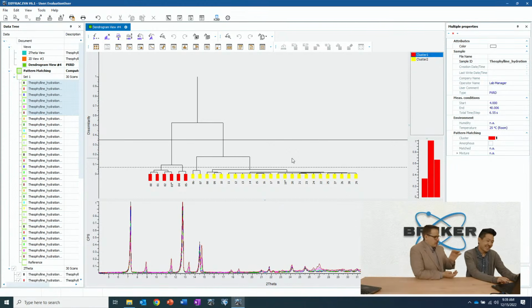To be clear, each of the little boxes at the bottom is a scan. It's breaking them up based on how similar they are to each other. It's taking every data point in every scan in this section. It's really cool that our software algorithms have gotten to the point where they can handle this number of computing problems at the same time, because it's a lot of data.